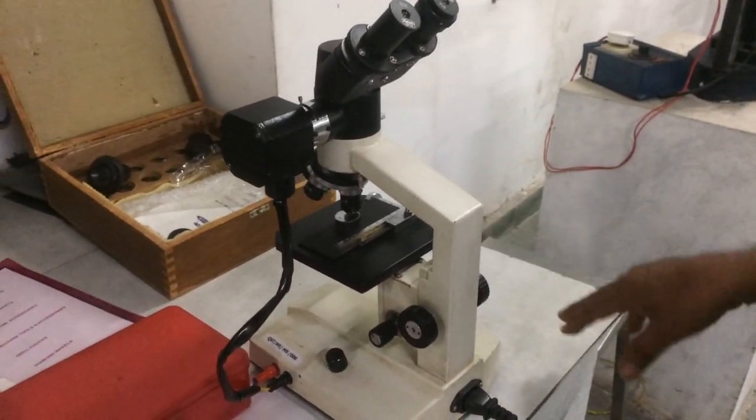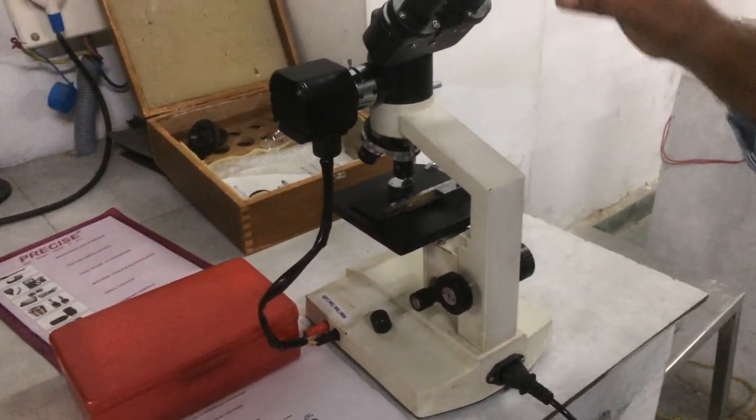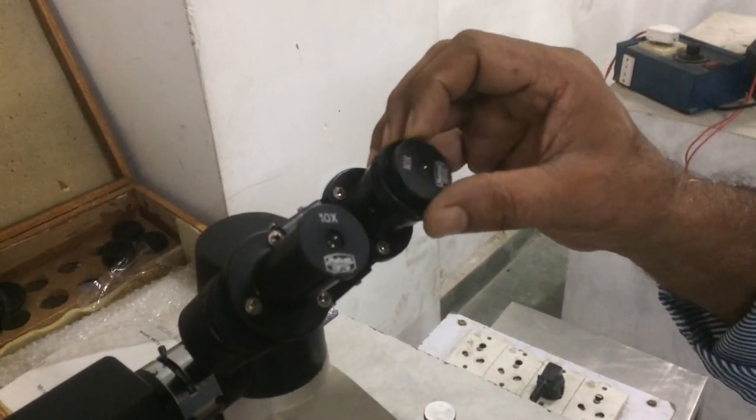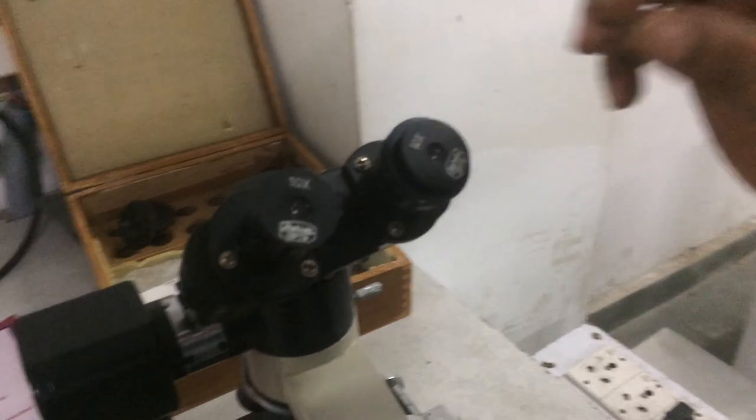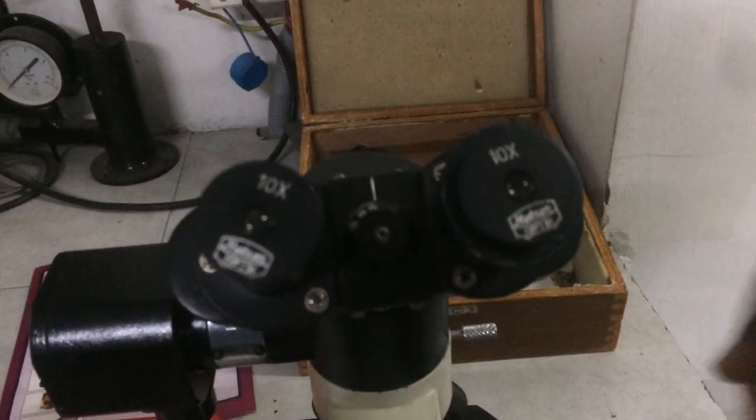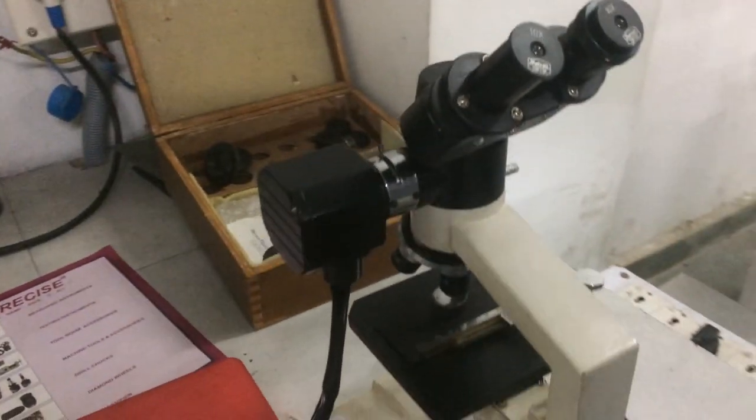The apparatus is shown in the video. We will just see that this eyepiece. It is numbered in 10x, 15x, 100x. So this eyepiece is shown in the 10x. 10x it will show the object picture.